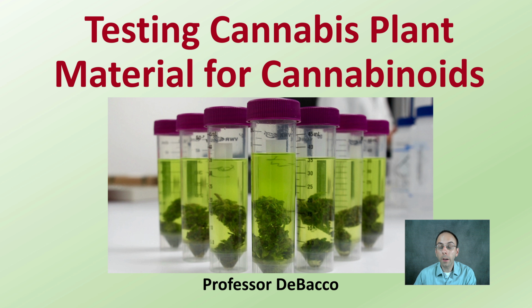So in this DeBacco University video, I'm going to go into testing cannabis plant material for the all-important cannabinoids, looking at some of the analytical procedures that are done and the importance of doing this on cannabis plant material.